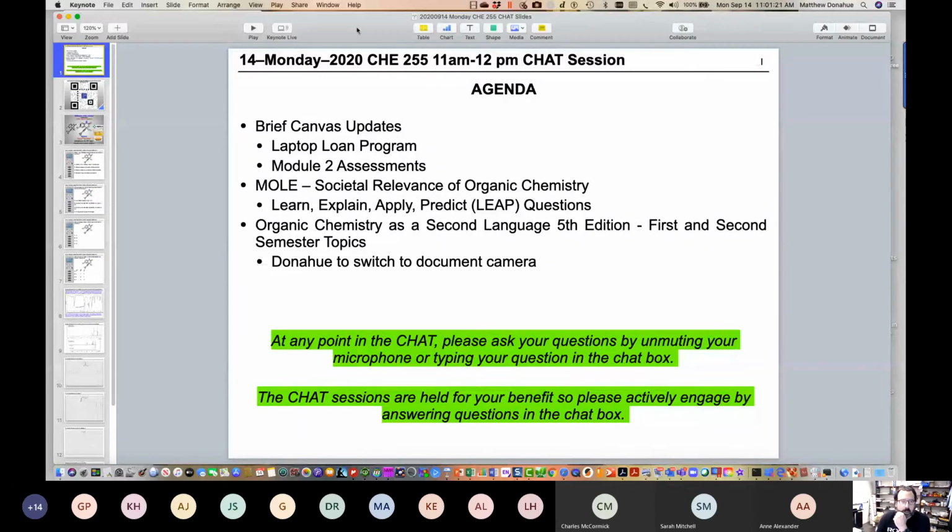All right. So today we'll start off with the same format as we've done before. We'll do a molecule of the lecture. We'll polish off what we started last week, and then we'll finally get to organic chemistry as a second language and look at some of the IR spectra that are present in the second semester topics, so we can get some practice in interpreting IR.